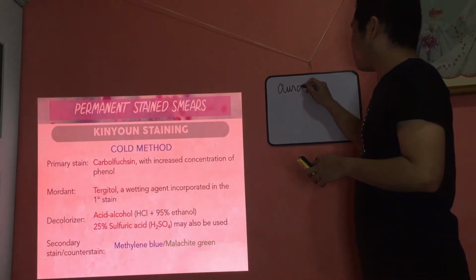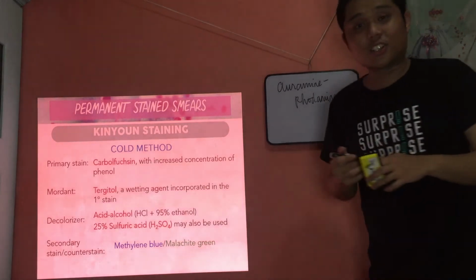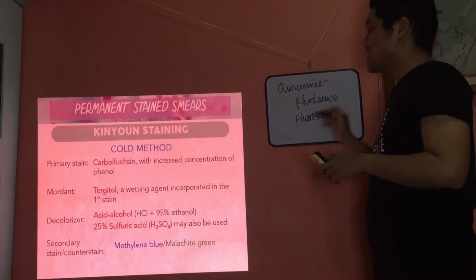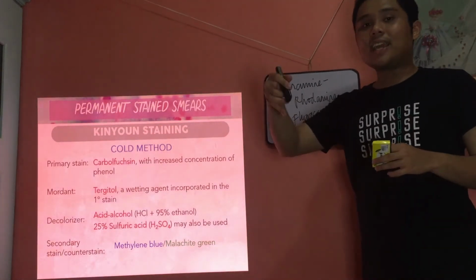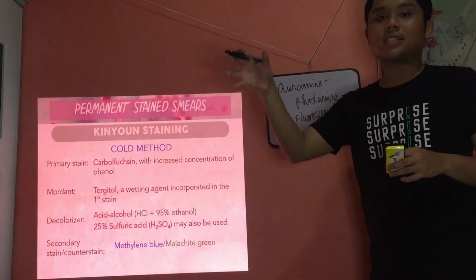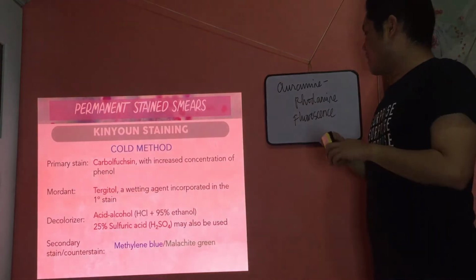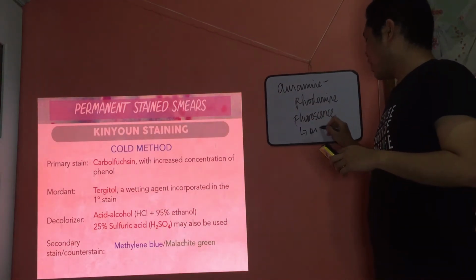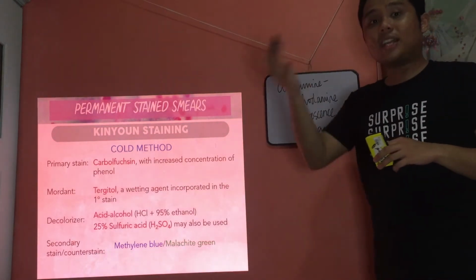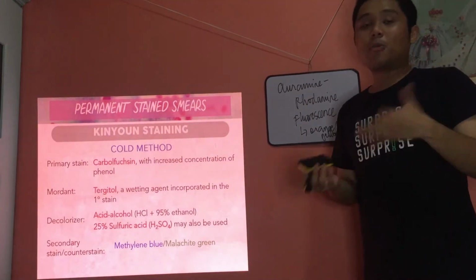Auramine rhodamine. Now, this staining method is a fluorescent method, so you use a fluorescent microscope. These are fluorescent stains that bind to the organism, and once you examine it under the microscope, they will fluoresce. They will give off fluorescent light. With auramine rhodamine, usually the Mycobacterium will appear orange or yellow, if I'm not mistaken. They will emit light, orange or yellow. That's auramine rhodamine staining, usually for Mycobacterium.